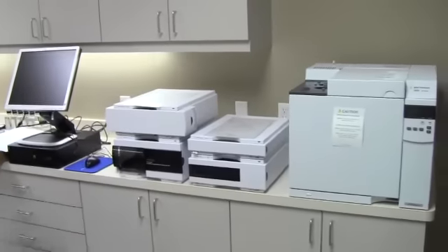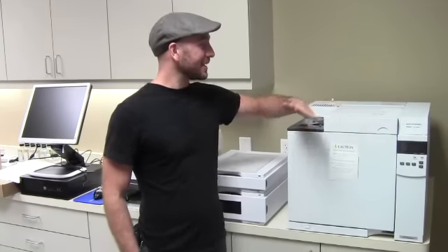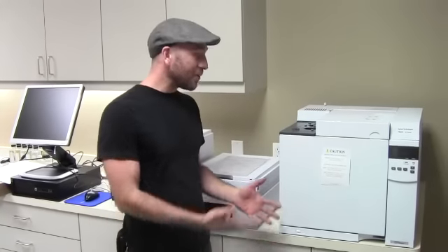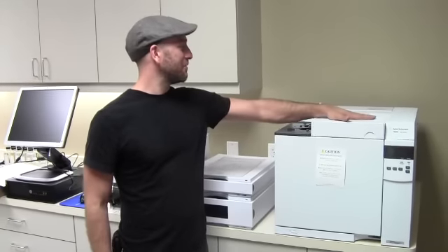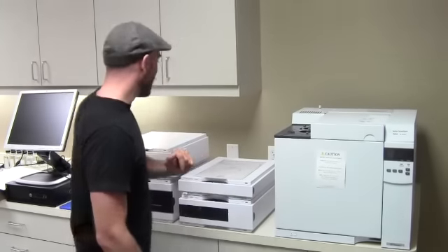So GC is a gas chromatograph, used for analyzing highly volatile substances — things that you can hit with a flame and turn into a vapor — which is perfect for analyzing spirits because we've already done that once. So when we collect our spirit, we can do that again and get really accurate measurements on the concentrations of alcohols, aldehydes, and acids inside the spirit.